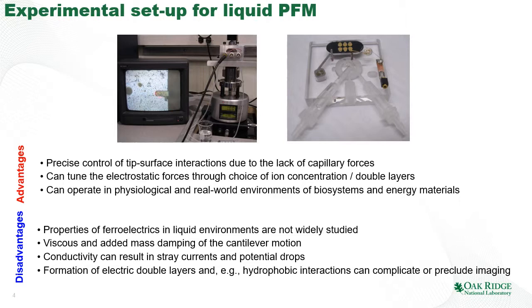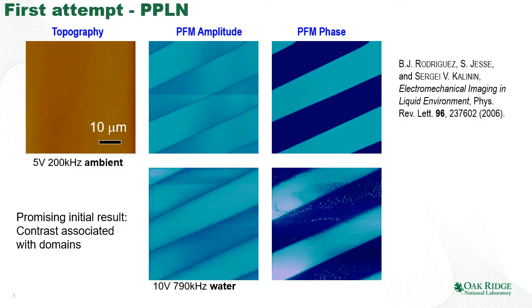The cantilever dynamics in liquids is different than in ambient. We can have stray electrochemical reactions and currents, and more complex interactions than in ambient. And at that time, we found out that, interestingly enough, we can run PFM in liquid environment and we can get very high quality images.